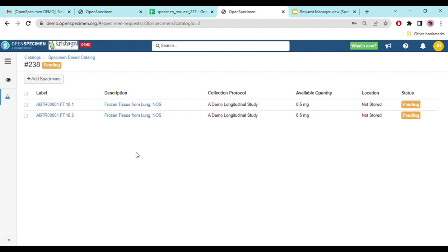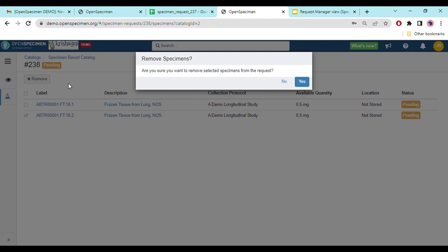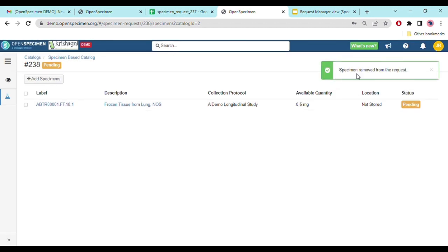To remove a sample, select it by checking the checkbox and the remove button gets enabled. Note that removal and addition can only take place as long as the request is in pending status — once you approve or reject the request, you cannot add or remove specimens anymore. Let's go ahead and remove the specimen. Once I click remove, it asks for confirmation. I'll confirm, and the specimen has been removed from the request.